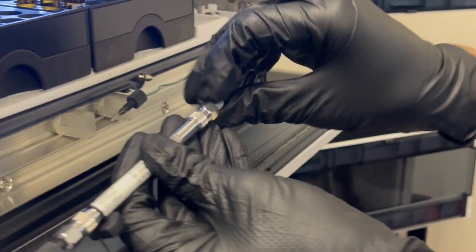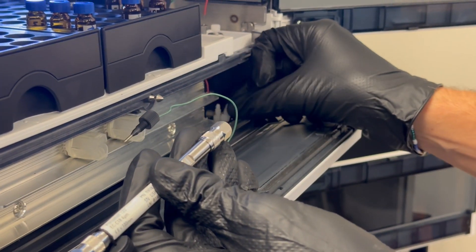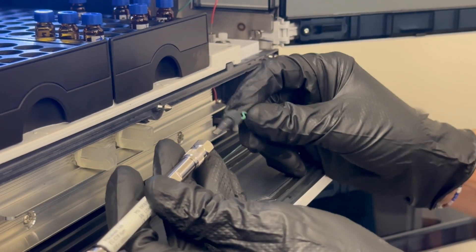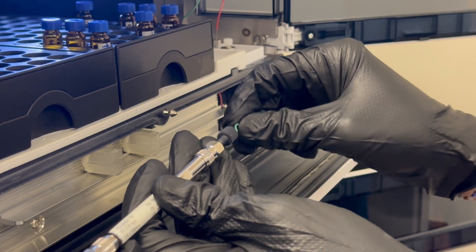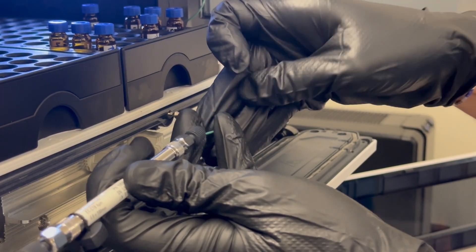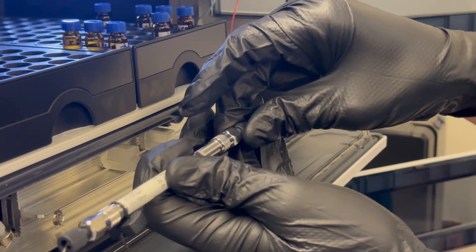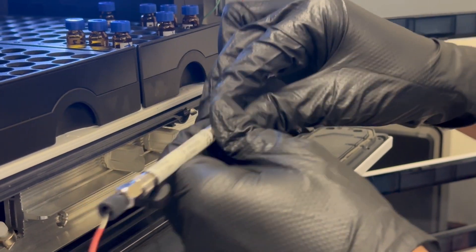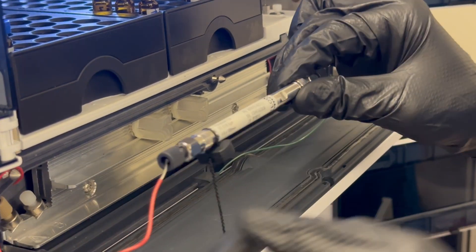We can undo our PEEK fitting that caps our outlet, and same process — reveal as much of that as you need, fully seated inside of the column. Then, while applying pressure, screw in this PEEK connector — and again, finger tight.